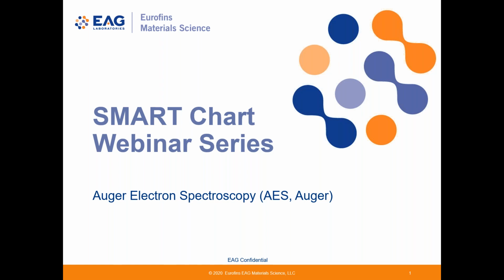And by the way, I often get asked about the pronunciation of the word Auger. Although it is spelled like those large drilling tools, it is named after the French physicist Pierre Auger, who correctly explained the origin of secondary electrons that were spontaneously emitted from ionized atoms in these Wilson cloud chambers. So these electrons were named after him, and I will soon share his explanation for the phenomenon in this webinar.